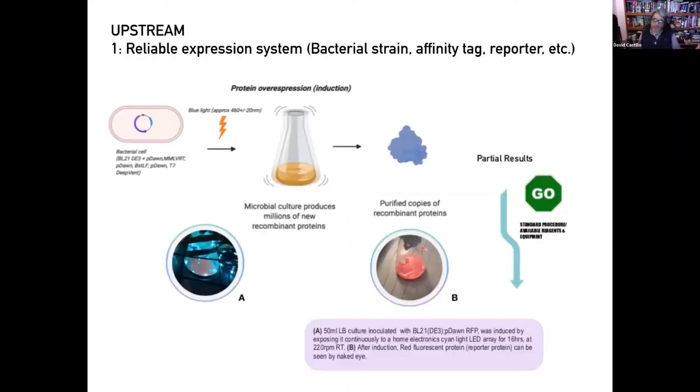So the upstream system. Whenever you need to choose which system you want to develop for your protein to be purified, you first need to have a reliable expression system. In this case, we decided to choose our light inducer system because we have already tested it many times. It's a reliable system that always grows in the same manner. And we decided to use it for subcloning the protein that we require.